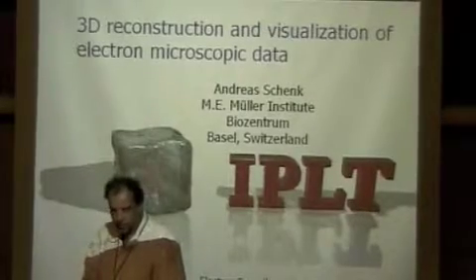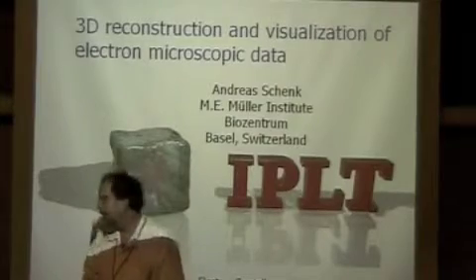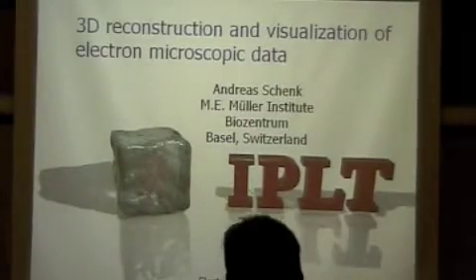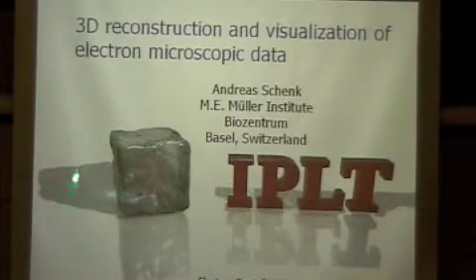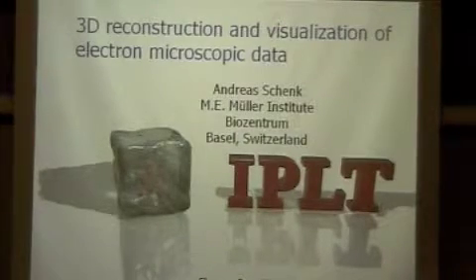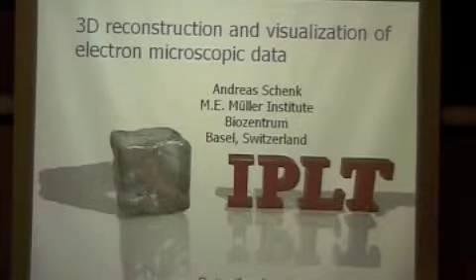The first talk is by Andreas Schenk, and he will mainly concentrate on visualization of 3D maps. Okay, as Tom said, we'll concentrate on visualization, so how you get your nice images once you really have assembled your data set in Merge. We'll try to be a little bit faster so that we can go along.